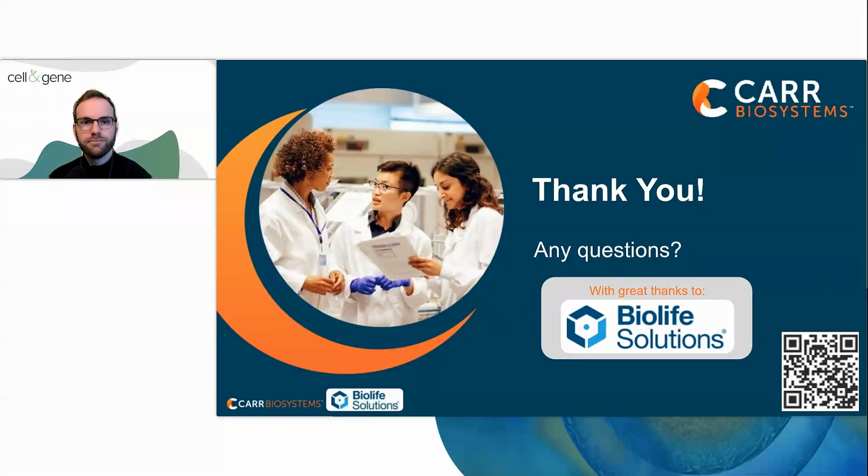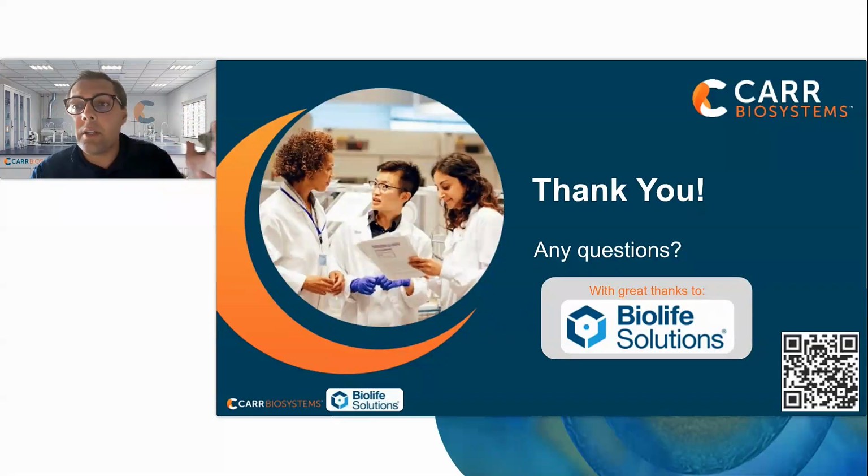Yeah, so I'll take the first part of this one. From the Unifuge, the single-use centrifuge component of this, there wasn't much optimization needed. The two key parameters utilized with the single-use tubular bowl centrifugation of the Unifuge are G-force, centrifugal force, and flow rate. So it's really just trying to find that optimal set of flow rate and G-force to maximize viable cell recovery. Throughout the first set of runs that we had done, we noted very clean supernatant lines when we were testing the waste stream to see if any cells were being lost. We didn't really see any of that happening. So there really wasn't much optimization needed from the centrifugation piece of this.